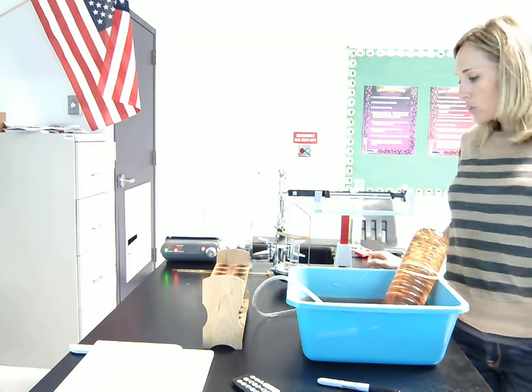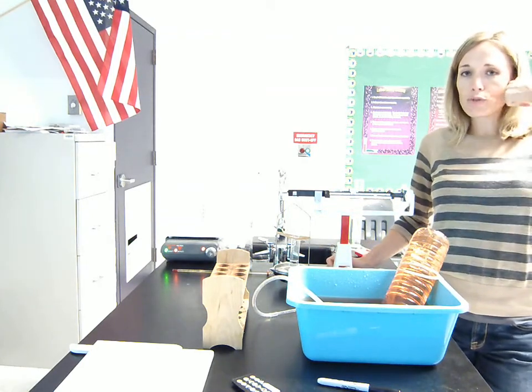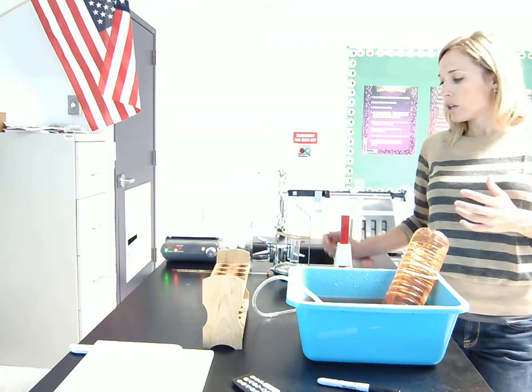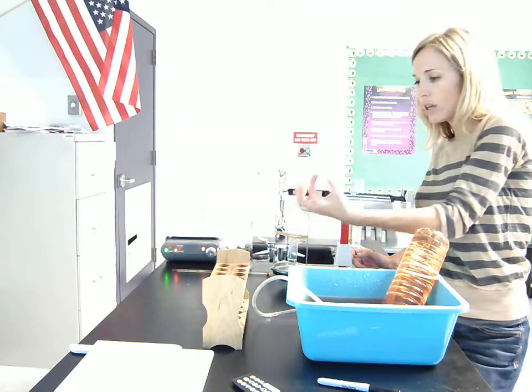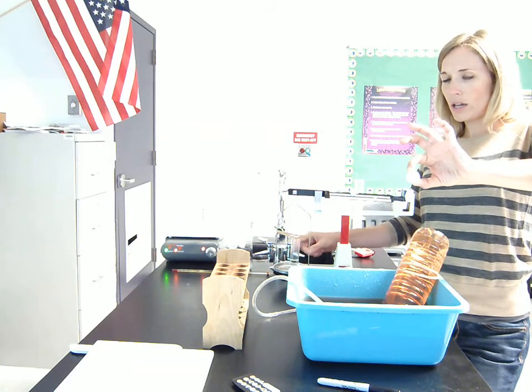Because we have to measure this indirectly, the way we're going to measure the volume of a gas, so actually let's back up. We're going to create a gas in the first place so that we can measure it. This is kind of like two labs in one that we've done before. We have an Alka-Seltzer on the balance, and we're going to use a whole Alka-Seltzer in this test tube of water to create the gas.